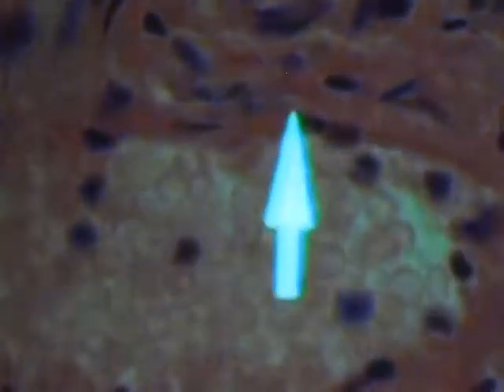Alright, so we can follow the connective tissue. This one would be a hepatic artery. We can see some smooth muscle surrounding the endothelium there. If you follow the connective tissue to the corners of the lobules, you see, okay, it's in here. Okay, here we go. Now we can see our hepatic portal vein here. This is the vein. You see the endothelium surrounded by some connective tissue. This is a little bit of a hepatic artery.